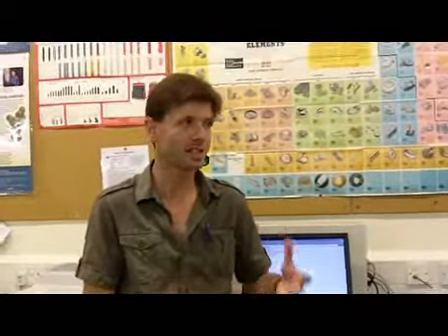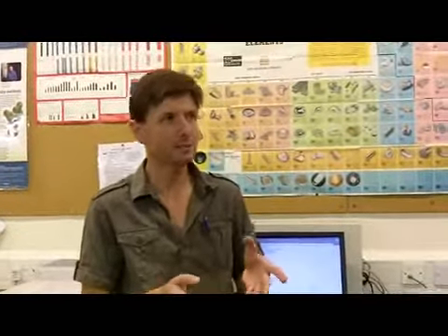It's a little bit hairy, and you've got enough to learn with this practical. So instead, we're going to take a simpler route. For this practical, all you need to do is measure the heights of the peaks.